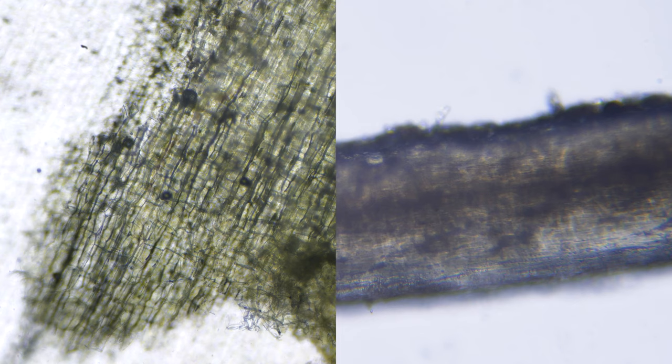Let's look at these two samples side by side — the plant cells and the animal cells. What differences do you notice? What similarities can you see?